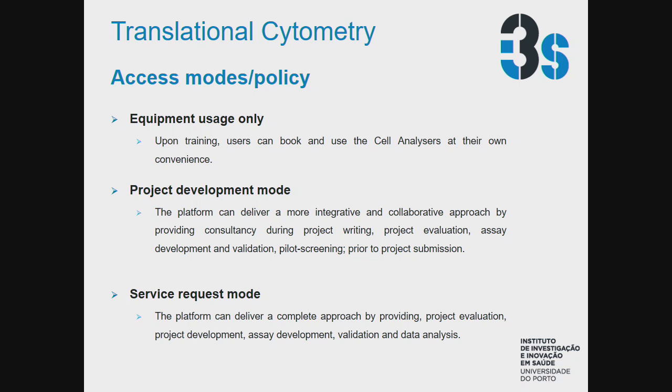As I mentioned before, after setup and training, the users can book the cell analyzers and use them as they want and at their own convenience. So the platform is open 24 hours per day for the cell analyzers. It's not the case for the cell sorting. The cell sorting needs to be done by a technician.